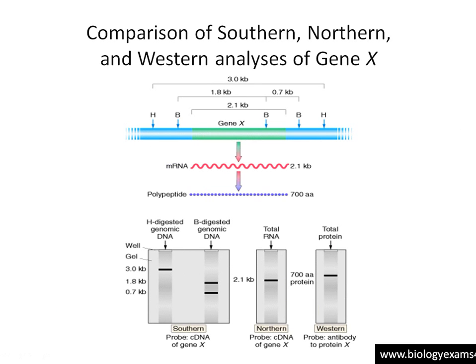According to the central dogma of biology, a gene is a segment of DNA that codes for a functional polypeptide. In a molecular biology lab, we may be looking at a specific DNA. For expression studies, we may be looking at an mRNA or a polypeptide. The technique to find a specific DNA in a sample is called southern blotting, whereas for expression studies we may look at either mRNA or a protein.